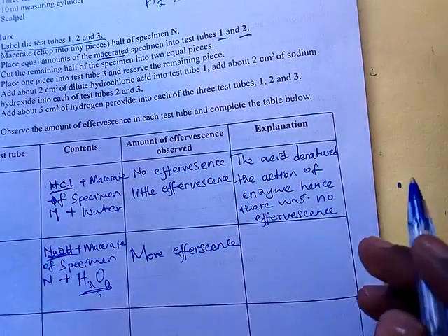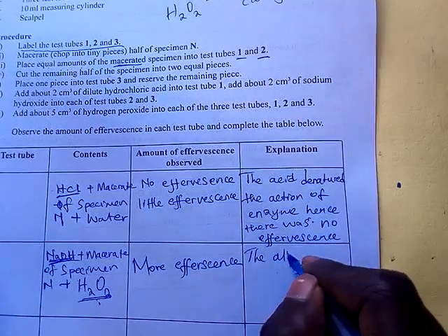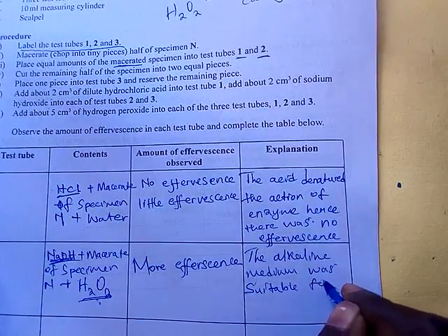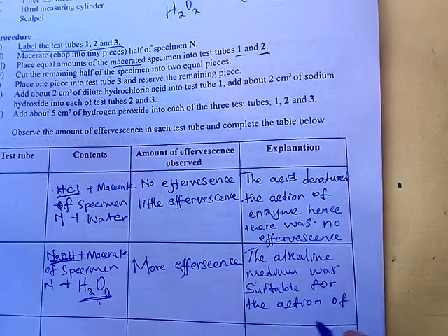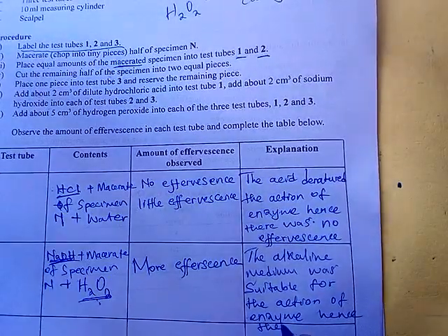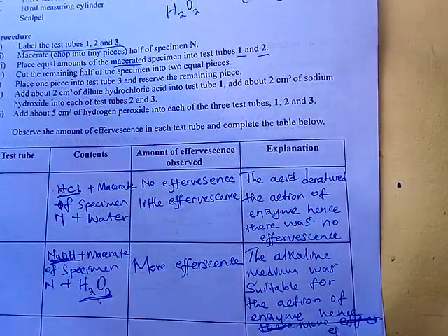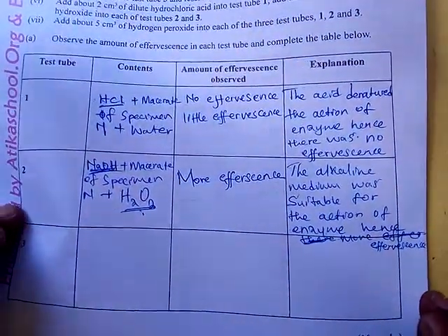and your explanation will be: the alkaline medium was suitable for the action of enzyme, hence there was more effervescence. Yes, let's go to test tube 3 and see.